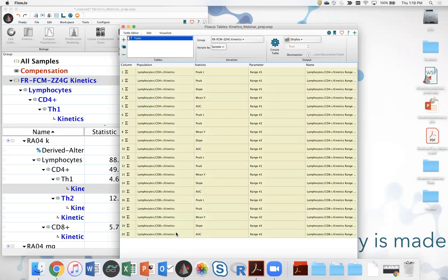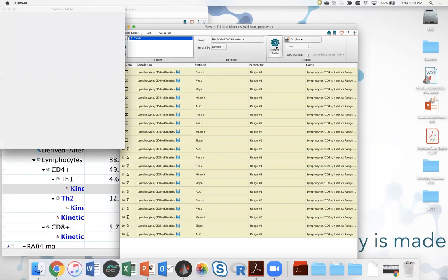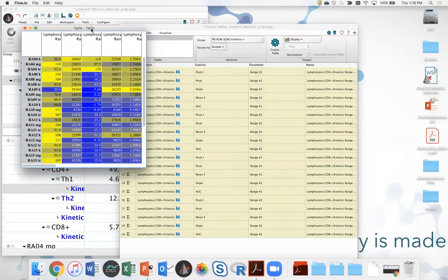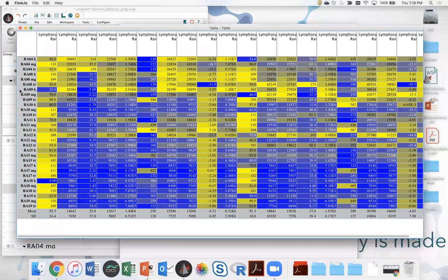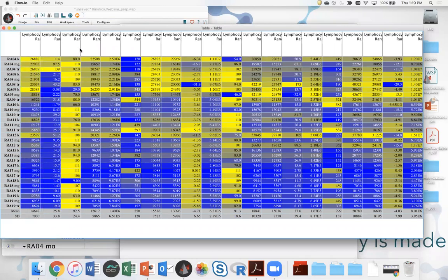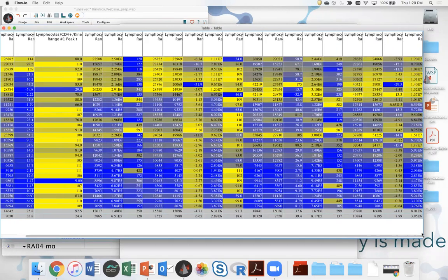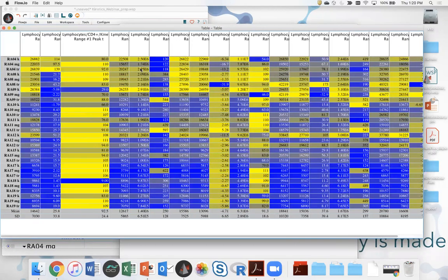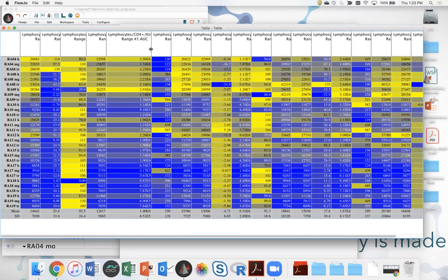I am going to highlight that, go to visualize, choose it to be a heat map, and then say create table. All right, so there we go. All right, so there are all my statistics. I might want a little more space here to get the name of those columns in, picking the full range was so-so, but there's peak time, for example. Range 1 area under the curve.